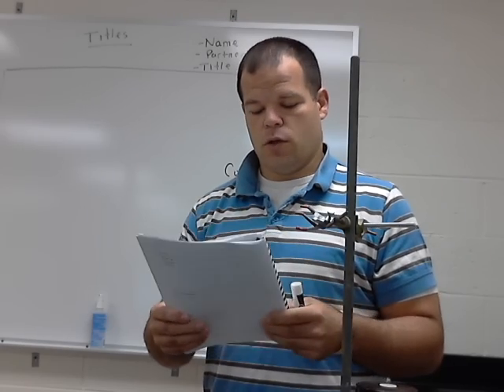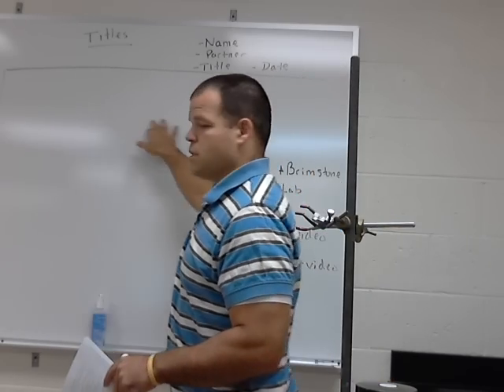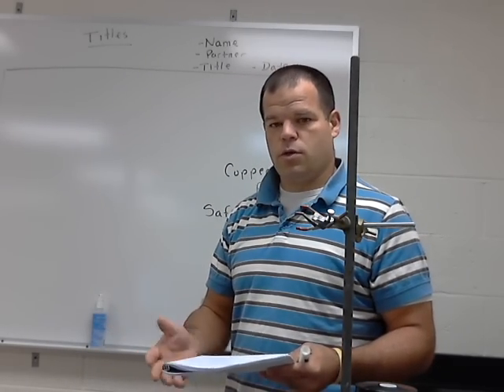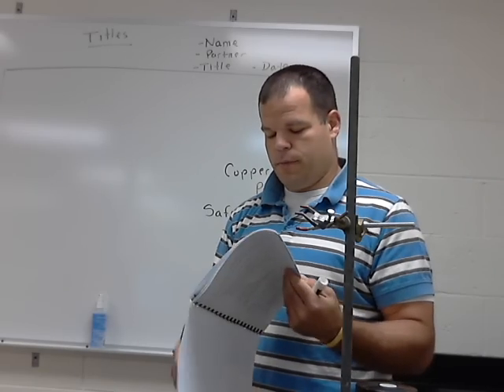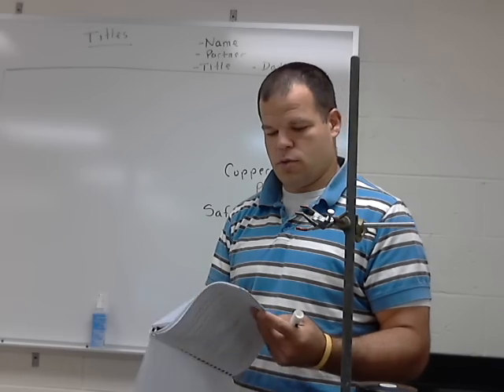Okay? So for example, and I'm going to start on the board here and work my way across, and this is an example. There's many right ways to do this. Okay, so the pictures are for you, but safety is my number one concern here, so you know what you're doing. The very first page, I'm just going to go right to the actual copper and brimstone lab.